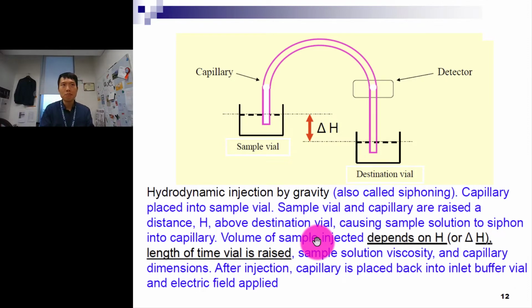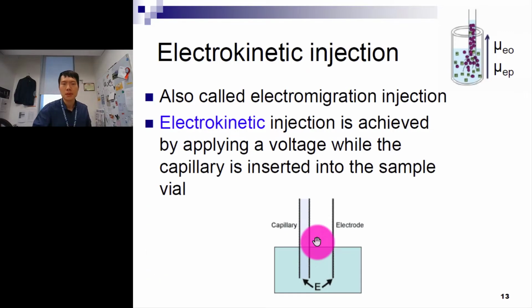Does it make it break more easily or something like that? But for vacuum, it is hard to create a vacuum. You need maybe a lot of power. And how can you ensure it's a vacuum, right? You need to ensure that the system is really closed, the vial cap is sealed. So think of the other considerations.